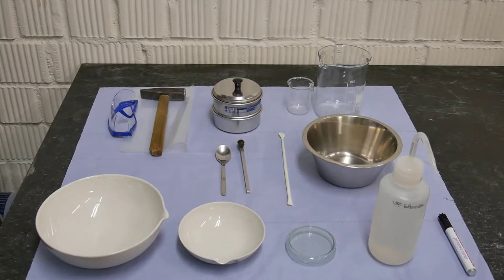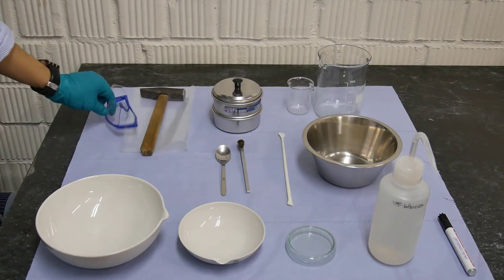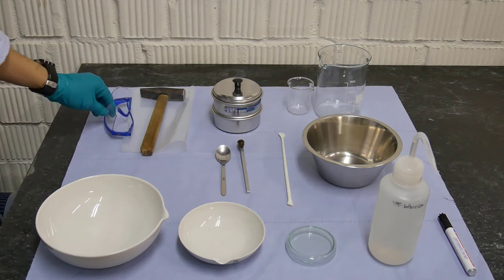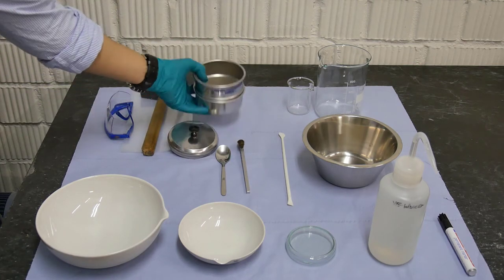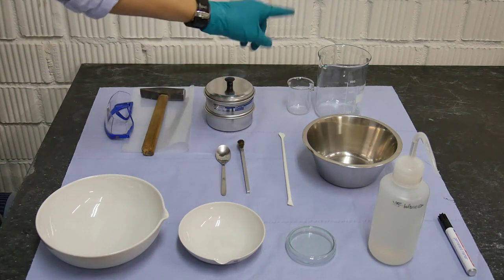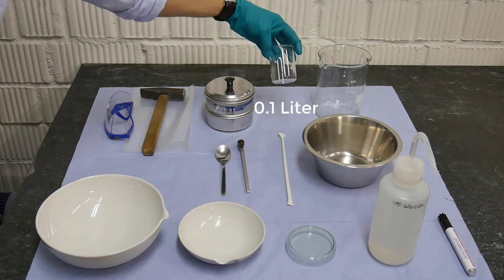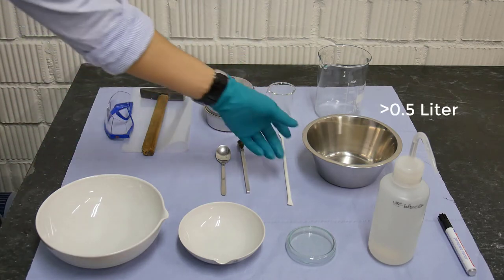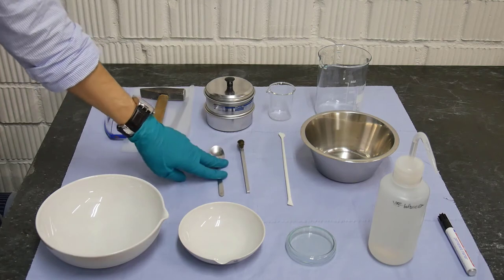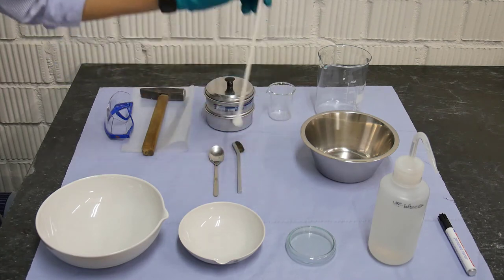Before we jump into the different steps, let's talk about the tools we need for this method. We need a hammer, plastic bags, eye protectors, a sieve usually of 200 microns, beakers — in this case we are using a one liter beaker and a much smaller beaker. We need a container, spoon, a brush and a stick to stir.